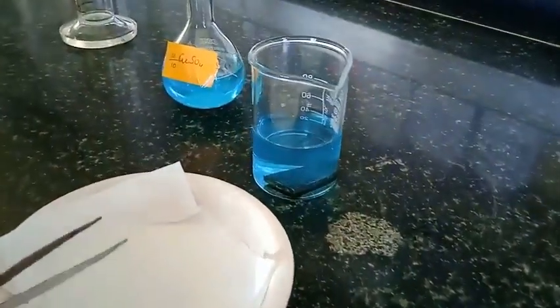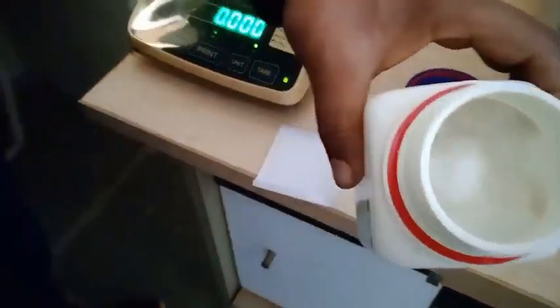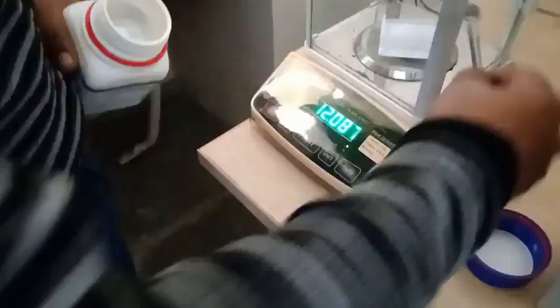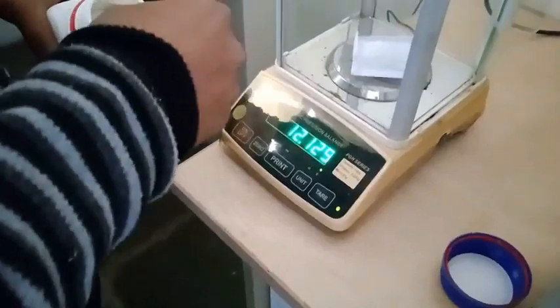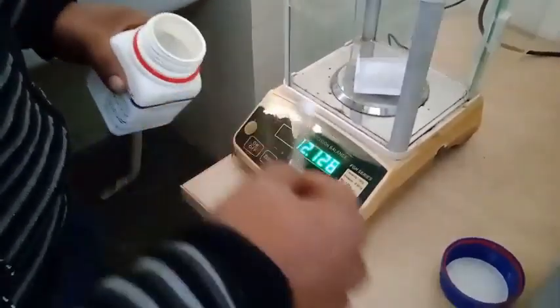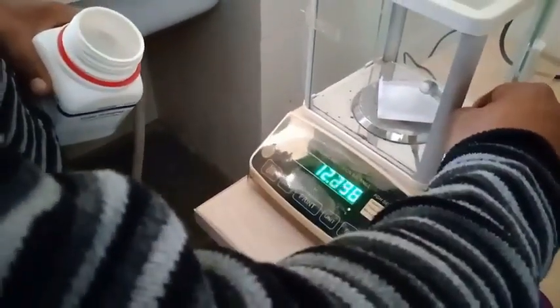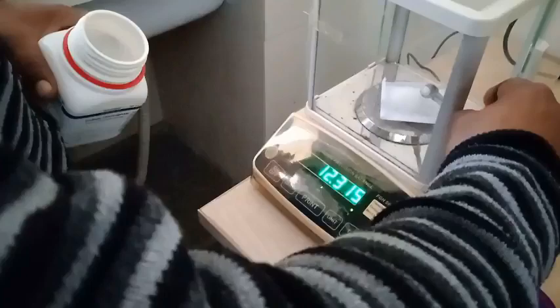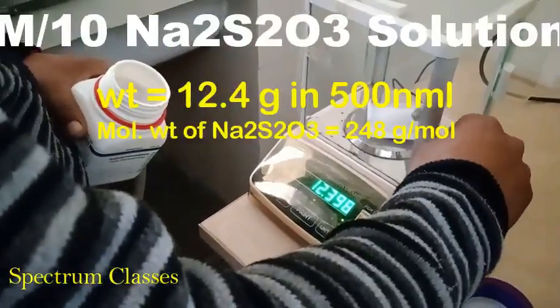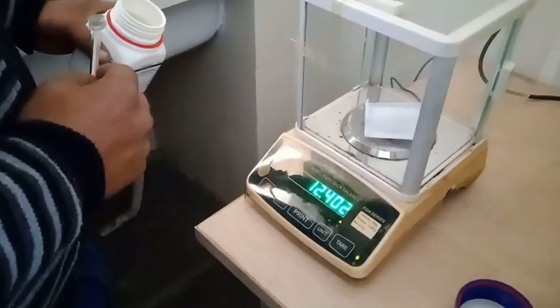In between, we are preparing the sodium thiosulfate solution because this is an iodometric titration. So for that purpose we require sodium thiosulfate solution, as I told you earlier in the starting of the video. So I am just going to prepare M/10 sodium thiosulfate solution and its molecular weight is 248 grams. And I am going to prepare it in 500 ml.